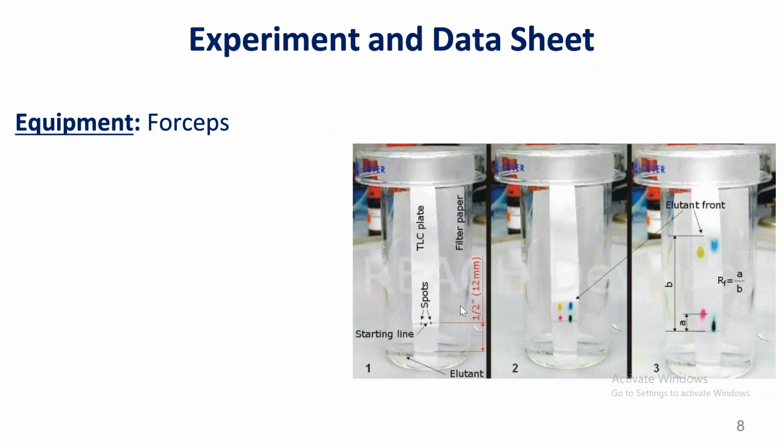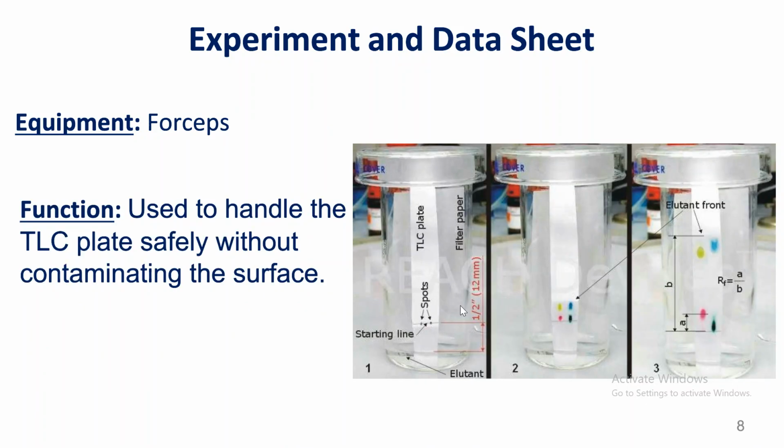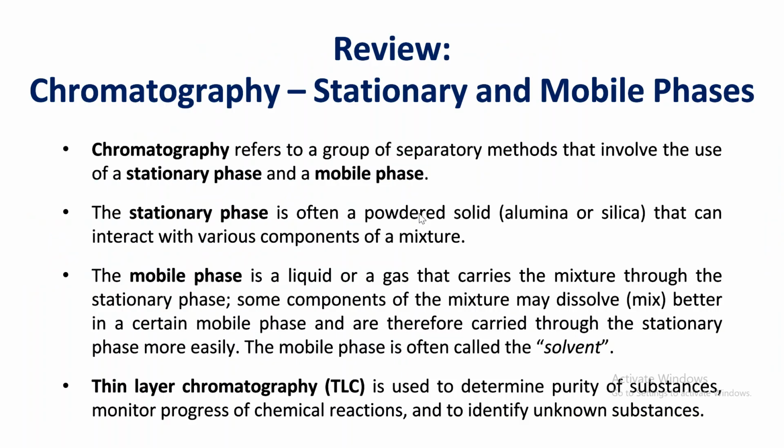And we are also going to be using forceps. Now, we talked about forceps in lab number 1. Forceps in this experiment is used to handle the TLC plate safely without contaminating the surface. So if we want to remove the TLC plate, we will do so using forceps.